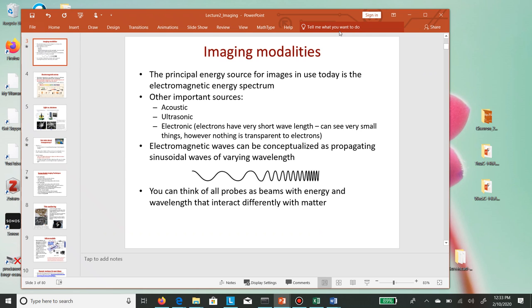Because ultimately, you are not interested in just an image, per se. You're interested in some sort of transport phenomena and how to quantify it. And images always contain some level of error and some level of noise, just like any other experimental technique, really. And you need to sometimes understand the source of that error, both in order to improve the image down the line, especially if you are collaborating with somebody who is actually imaging, or possibly you are imaging them yourself. You need to understand what is the type of noise and how can you improve it, if you can improve it at all.